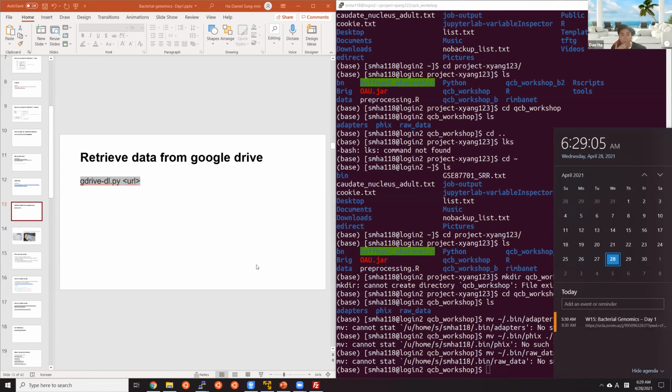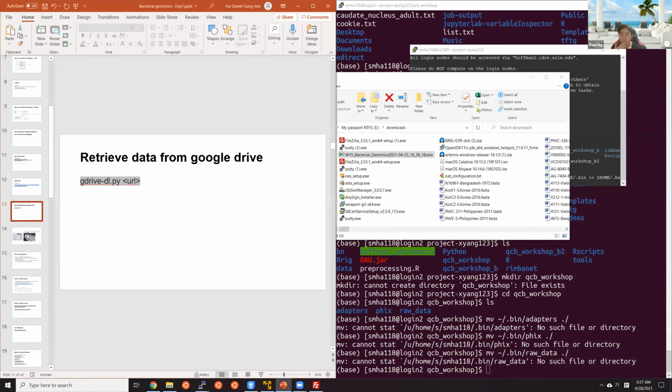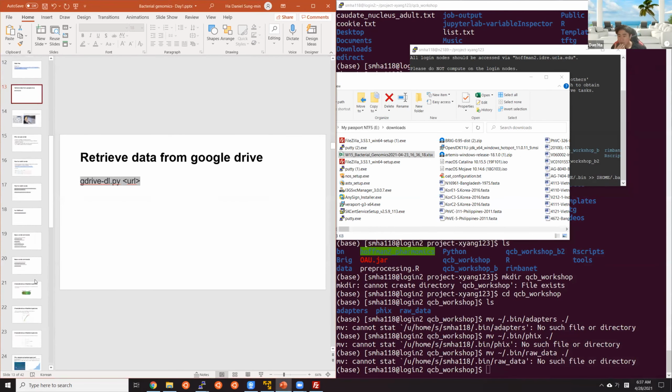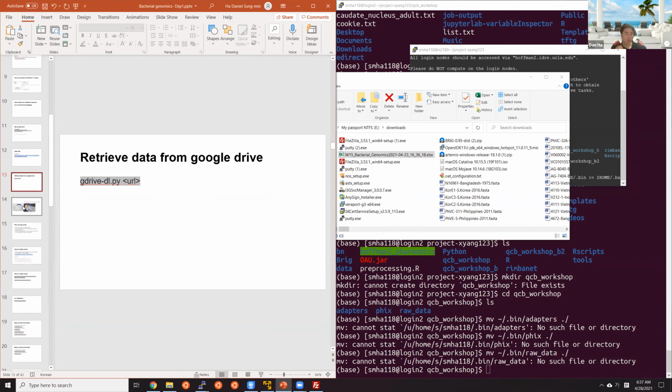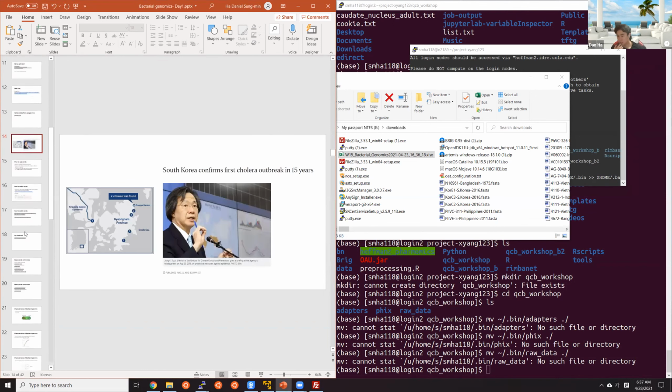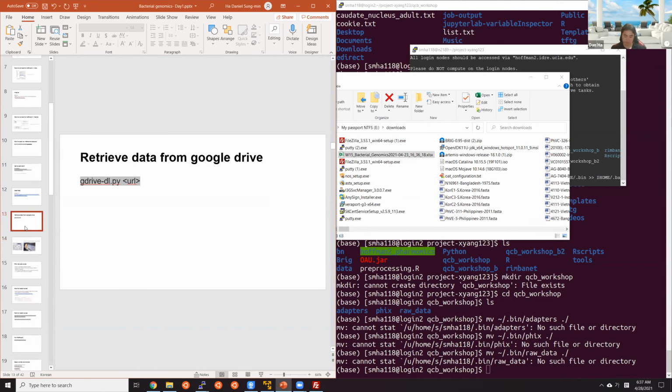I guess a few of you still haven't got the node yet. Okay. Let's keep on waiting. We don't need it right now, I guess, until later on in this slide.